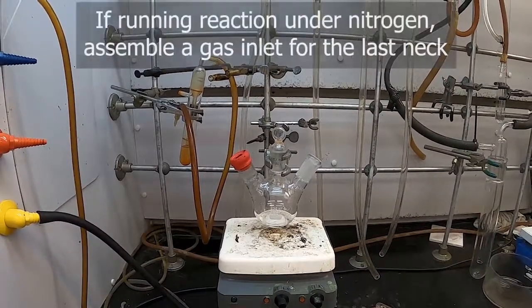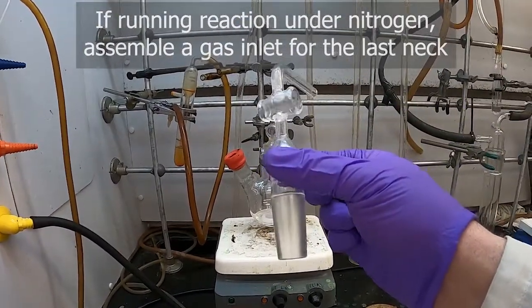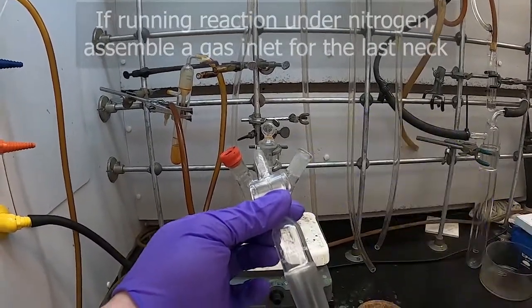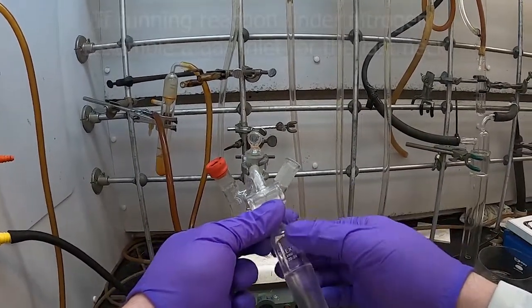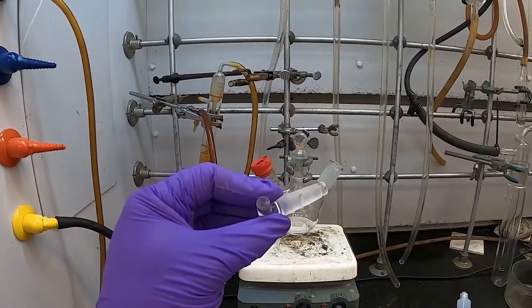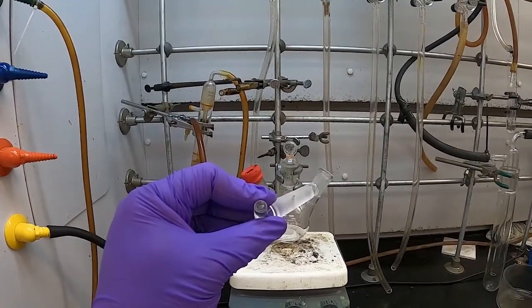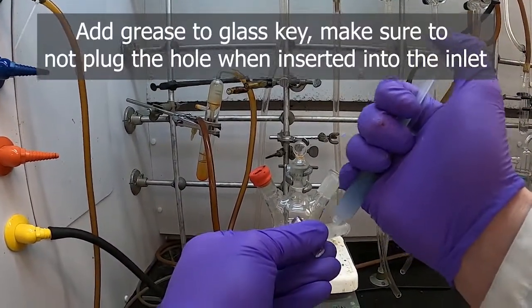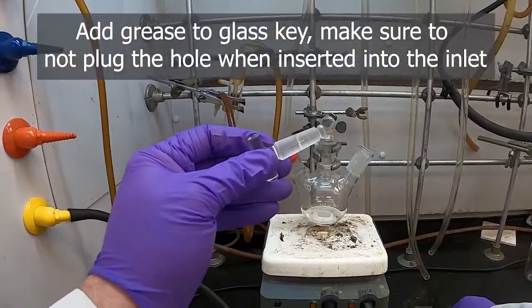So now we're going to assemble a gas inlet for our apparatus here. That looks like this. We need to grease this area here where the key will go in, which is the valve that controls the airflow, and then of course the ground glass joint for it to interface with our flask. And then this piece is what we call a key. It has a small hole here that will allow for the gas to go through. So we'll start by greasing this. This will just take a little bit. We'll put 2 little streaks on it there.